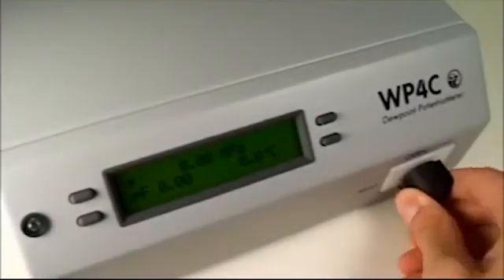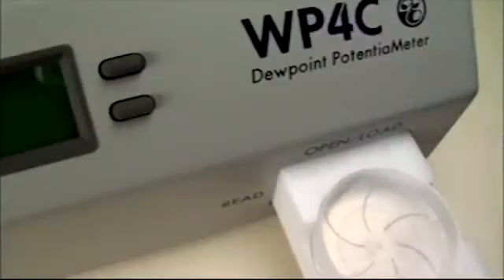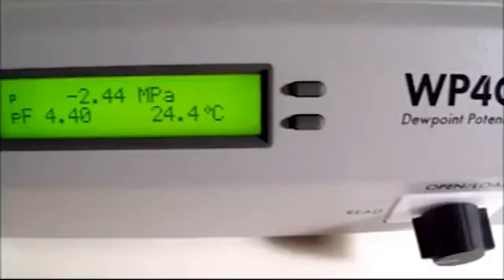Like most precision equipment, your WP4 will perform below its potential without regular verification. We recommend that you check the calibration prior to each day of use, and clean the instrument if the readings are off.